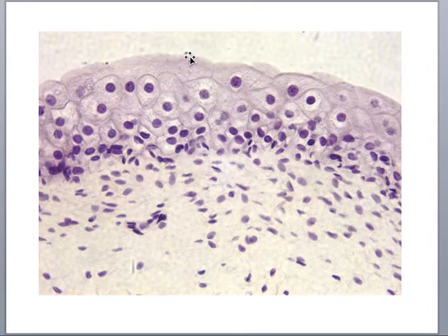All of this junk right here that's on the top of the cells, this is actually a lot of mucus. So these cells have the ability to produce mucus to help protect themselves because the urine can be very caustic, because it's all the waste that we're getting rid of, right? So it can be caustic and harmful. So a lot of times you'll see this big, thick mucus layer, and that's just to help protect the cells of this transitional epithelium from the toxic urine, okay, or things that could be toxic to the cells.